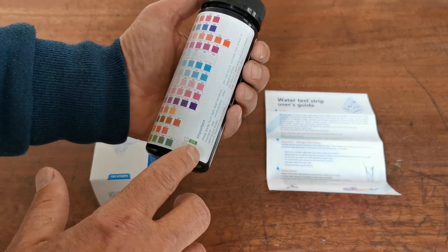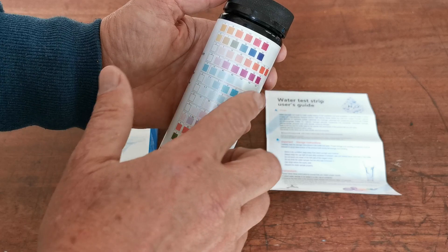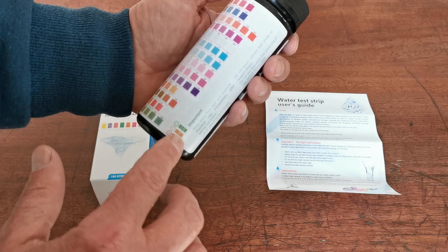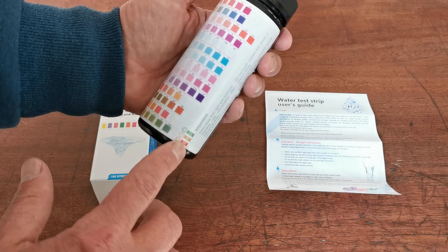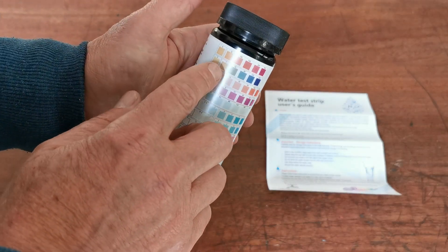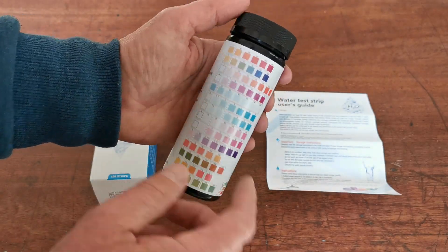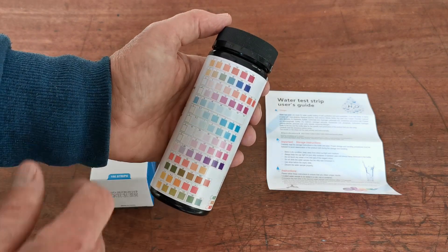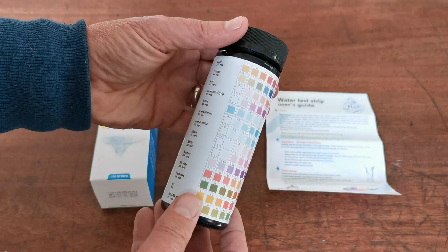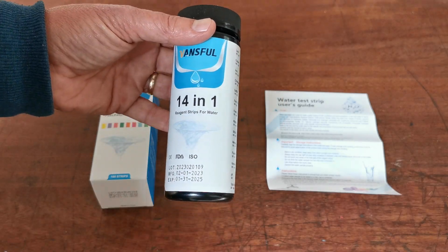On these manufacturer's packs you'll see that they've put color outlines around what is okay, alarm, or extremely alarming — i.e., high levels. If the pad reading comes in within what is expected at a normal safe level, it will be within one of the green boxes. If it falls in one of the red or yellow boxes, that is a cause for concern and may need further investigation.